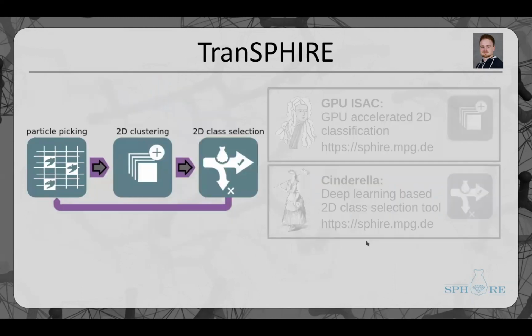The feedback loop is pretty simple. We start our particle picking, we do 2D classification, and then we select the good classes and provide the positions of the particles in those good classes to crYOLO. It will retrain its model, and we do that again. We do that a couple of rounds until a user-set number of rounds are done.